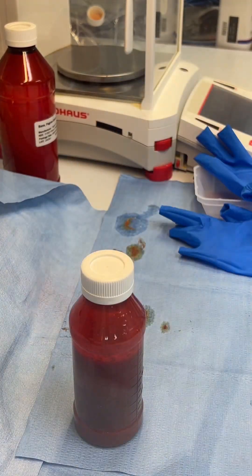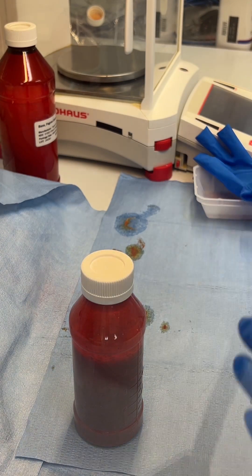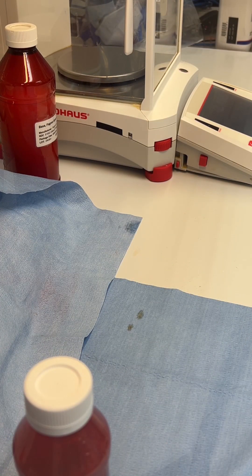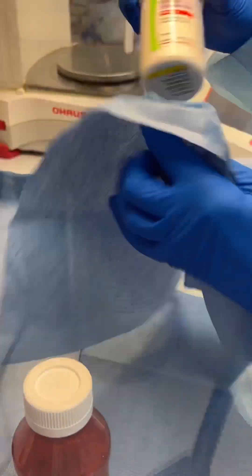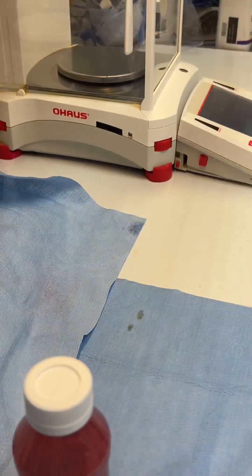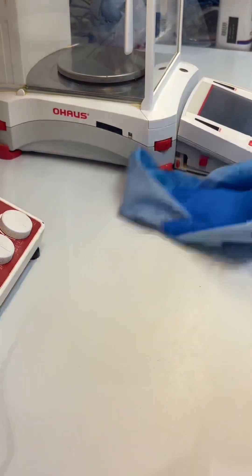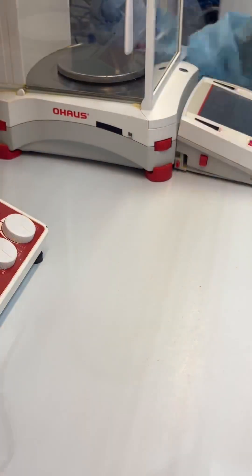I like to put down a bunch of lint-free towels whenever making a rifampin suspension — this makes cleanup a lot easier. I will wipe down all of my suspending vehicle bottles with some isopropyl alcohol, as well as our final prescription product. After all of that is cleaned up, I will wipe down my surfaces with some more isopropyl alcohol and we are ready for our next compound.